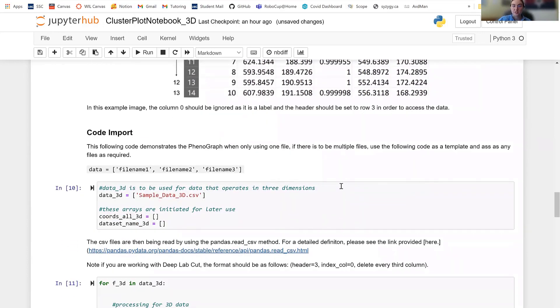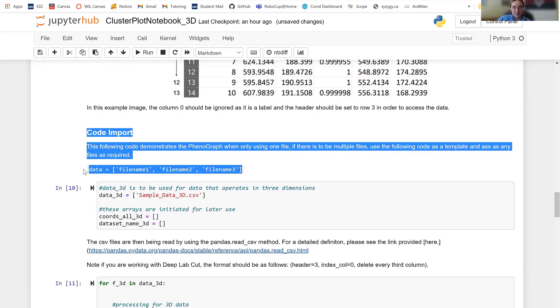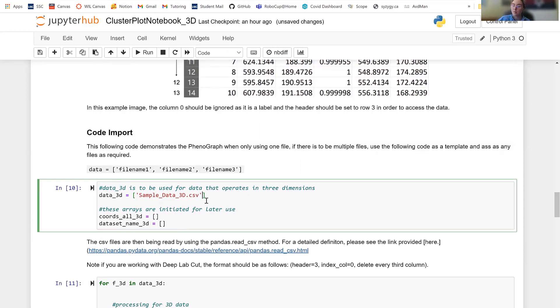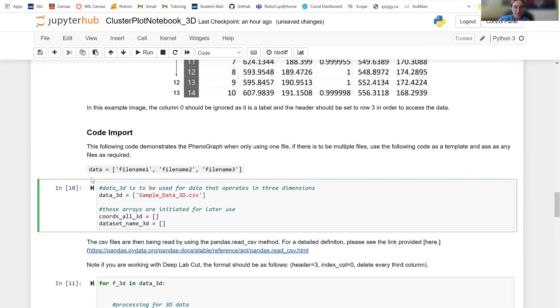Next, we're actually going to import this data. So here, I'm only using one file. But if you were to use multiple different files, you would put it in this array as detailed here in this explanation. But I'm only using one. And this is the name of the data that I'm reading from. So sample 3D data. So it's important that you get the name right. And it's important that it's in the folder path that you had specified before.